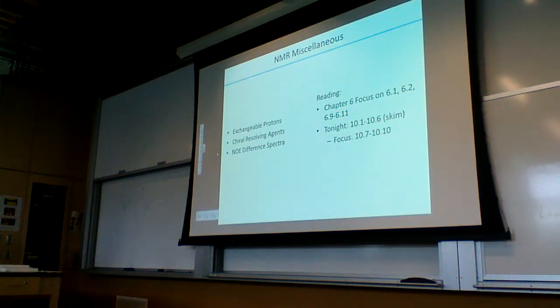Actually, this one that I was going to pass out, because I decided I didn't like my COSY example I picked off the internet. I do my own. And so the peak I'm talking about is that one.